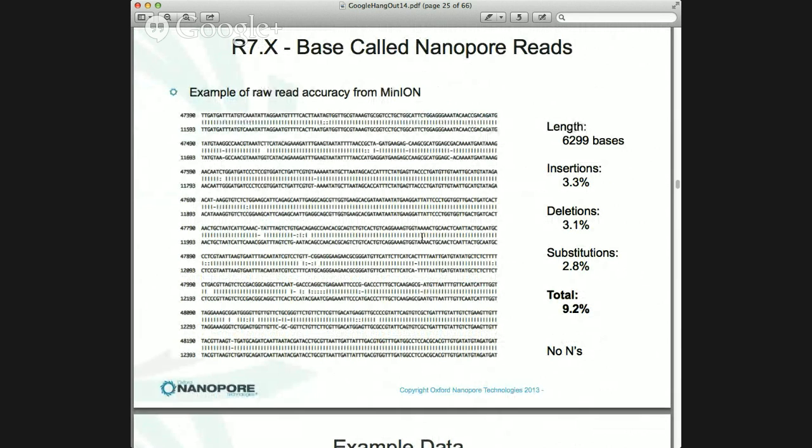Tuned up a little bit with base calling and whatnot. Now again, it's very different. The alignment parameter is different, and you effectively have an enormous multi-KB read with good, a little bit bad, good, a little bit bad. And that's how the data is as it stands right now.